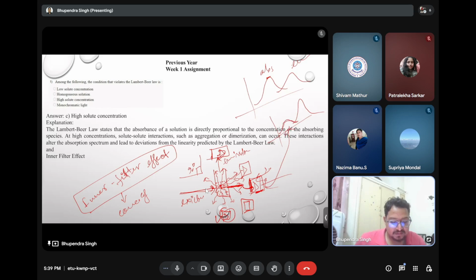Maybe your emission alone and your absorption previously. If you take this cuvette in the absorption spectrophotometer, you'll get the absorption something like this. And this point is critical. These are overlapped, sometimes very overlapped.